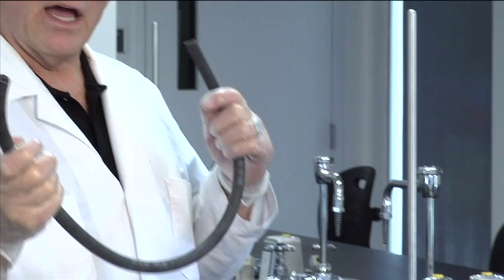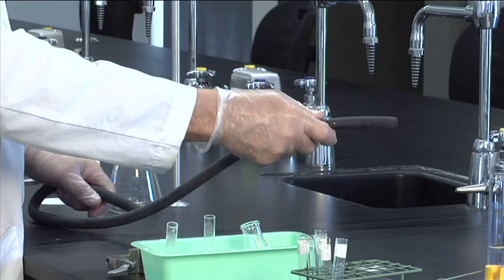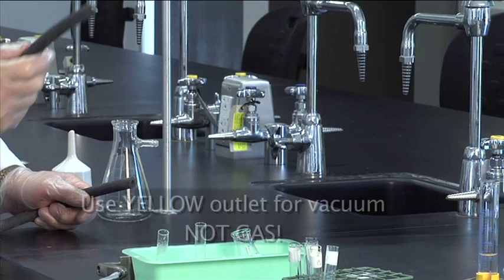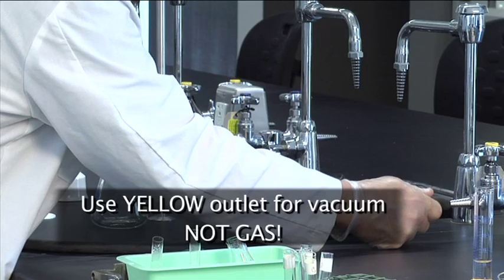We have two outlets on the bench. One of them is labeled gas. One of them is labeled vacuum. Which do you want to choose? We've done the one where it's hooked up to gas. You don't want gas. You want the yellow one, vacuum.